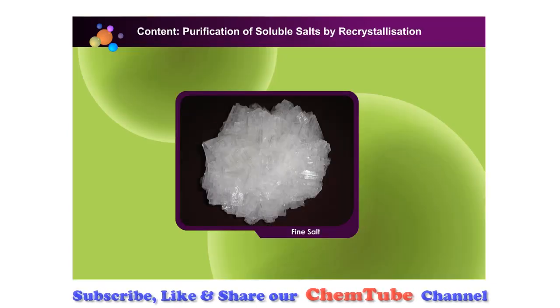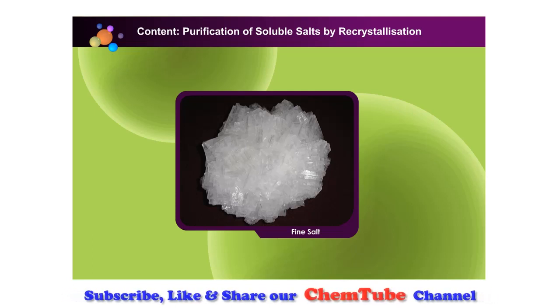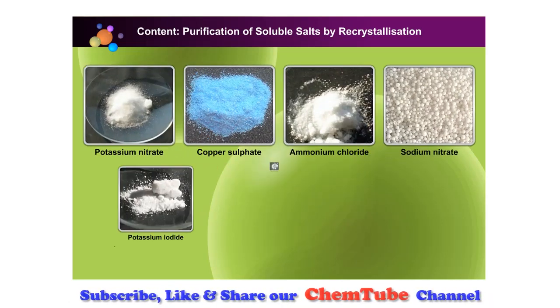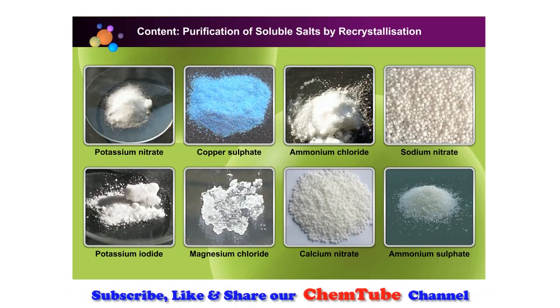Do you know how we can obtain pure salt? Let us conduct an activity to purify salt. We will observe how a soluble salt is made more pure through re-crystallisation. Re-crystallisation is a useful purification method for most compounds that are solids at room temperature.